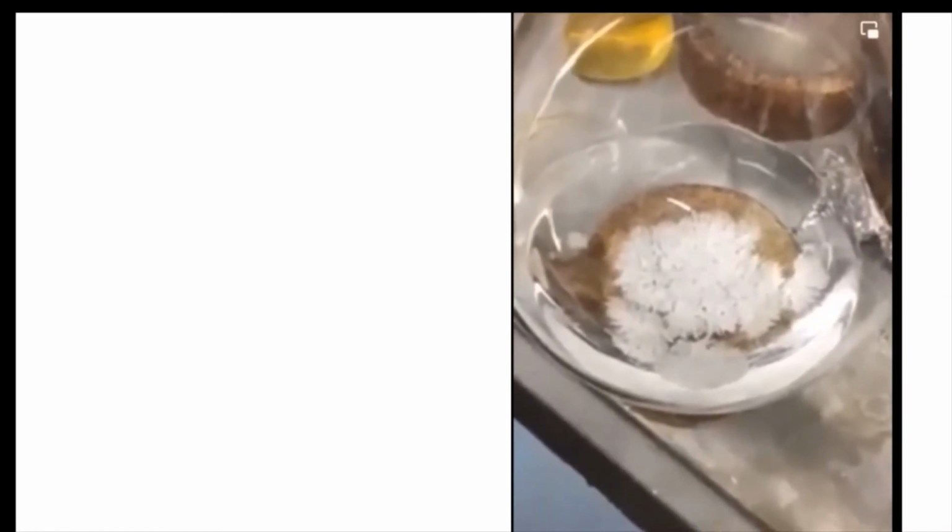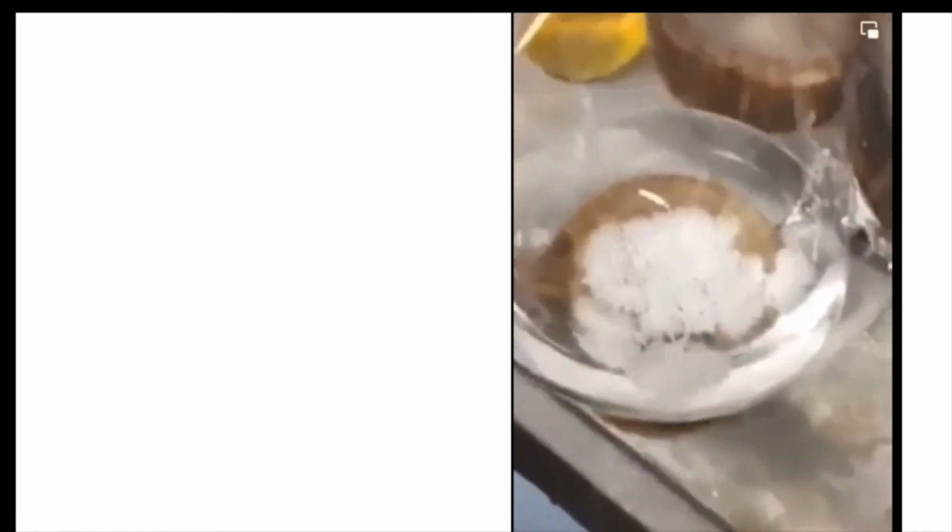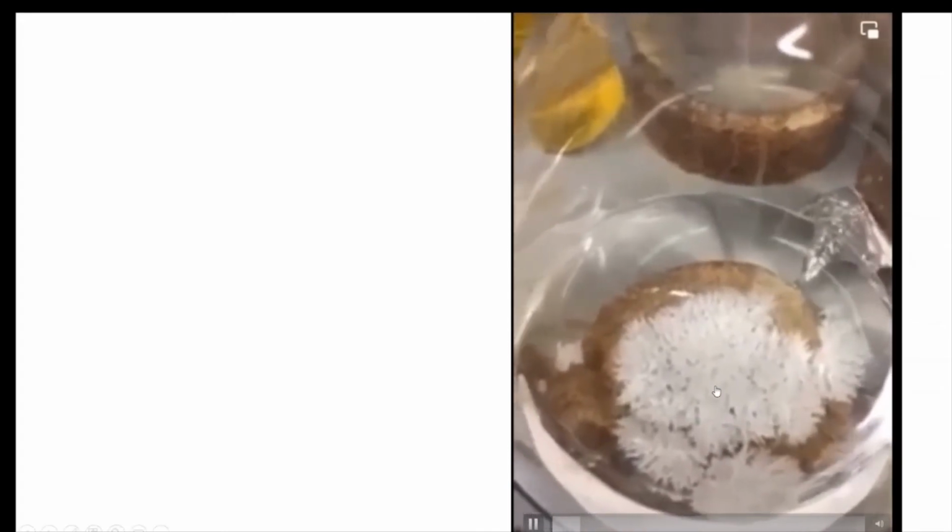Today I'm going to show how to do recrystallization of your crude product as a pure solid. Here is a video I'm sharing, which is a crystal growing in acetonitrile. I used 100% acetonitrile to grow this crystal, and ultimately I got the 100% pure compound.